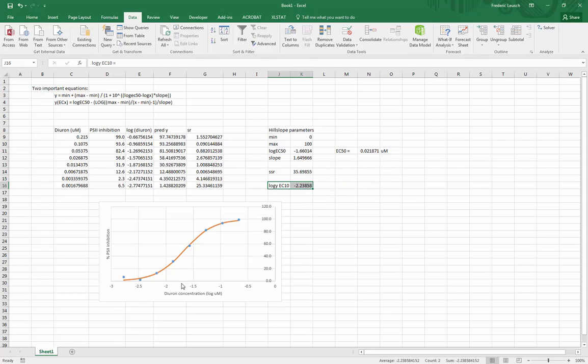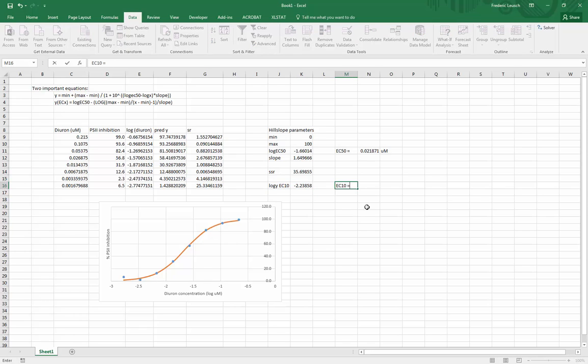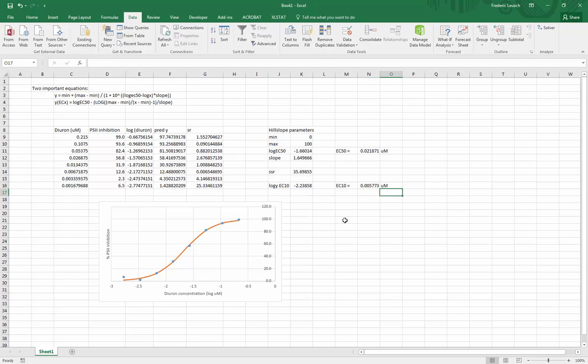Let's probably move it to the log column otherwise it's going to confuse everyone. But here's this value, here's my EC10. This is basically saying that to reach 10 percent I am at an x value of minus 2.2 on a log scale. Again to get this value in a natural scale, it's EC10 equals 10 to the power of this number here, and here's the EC10 for this assay, 0.005 micromolar.